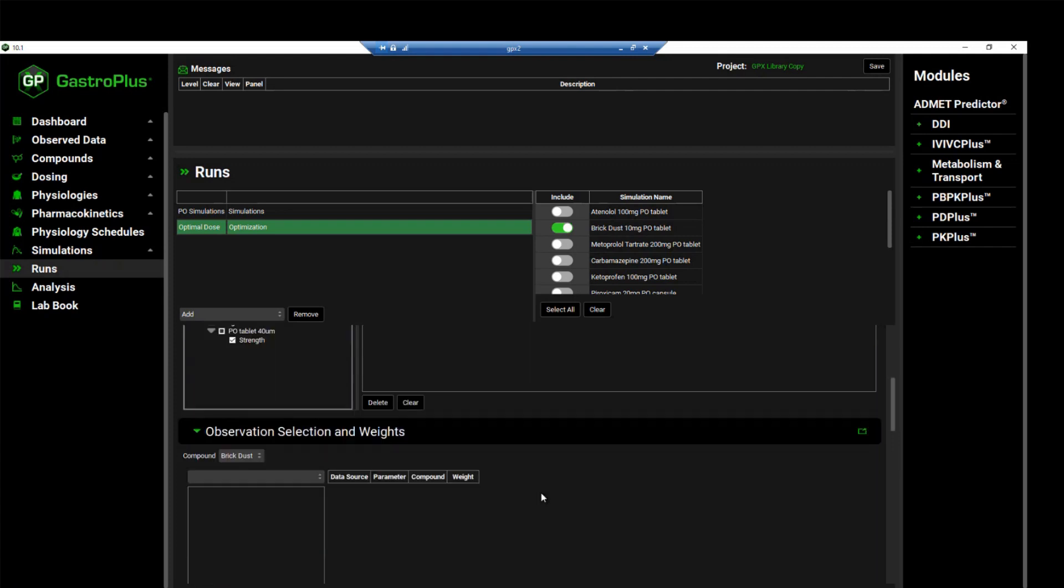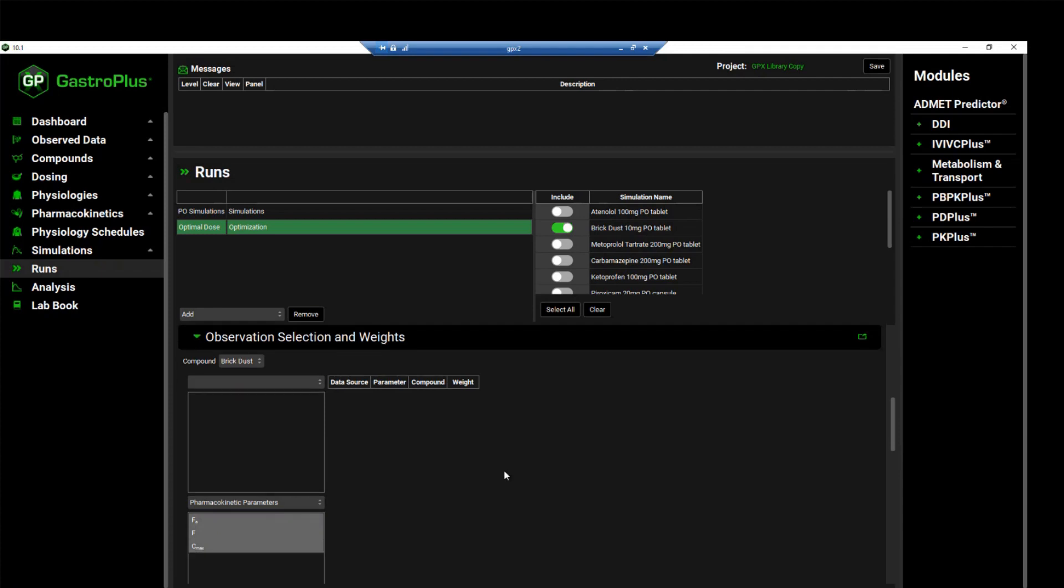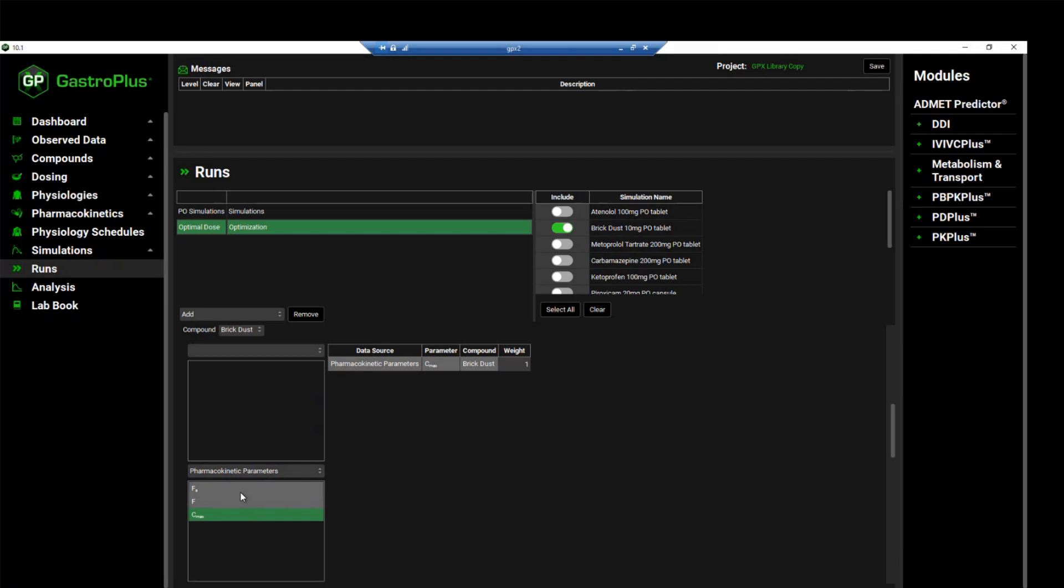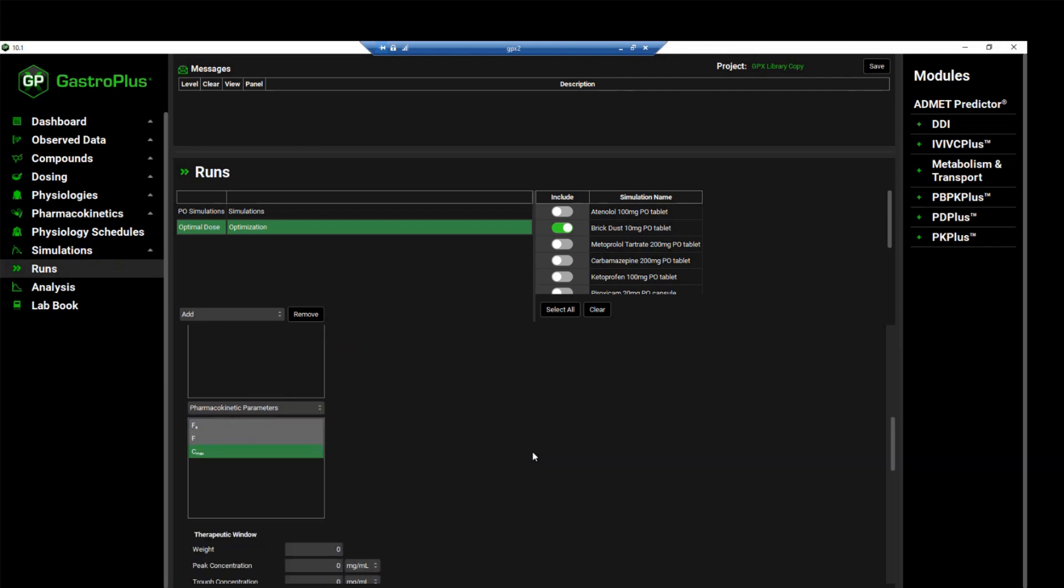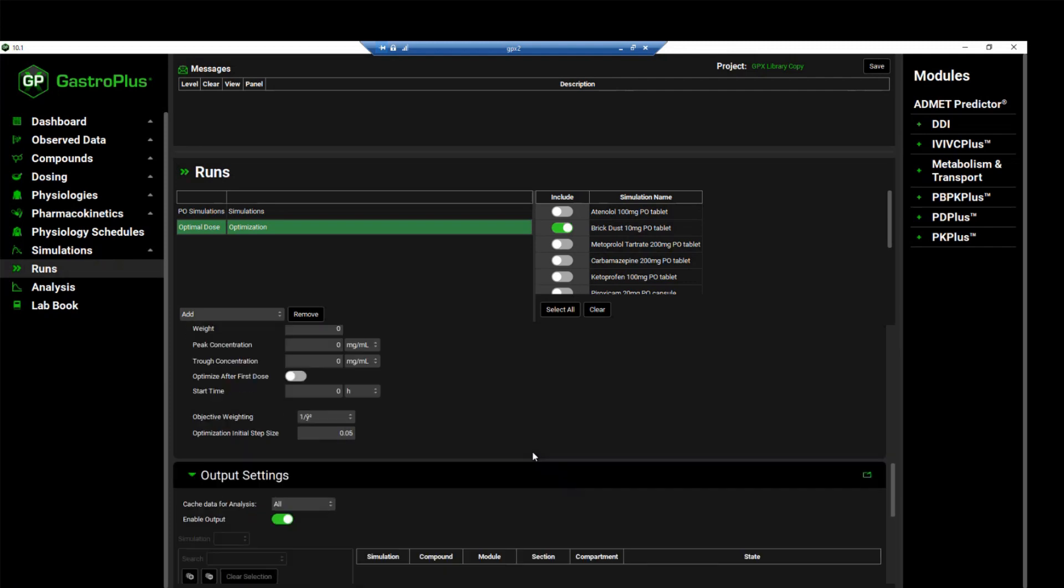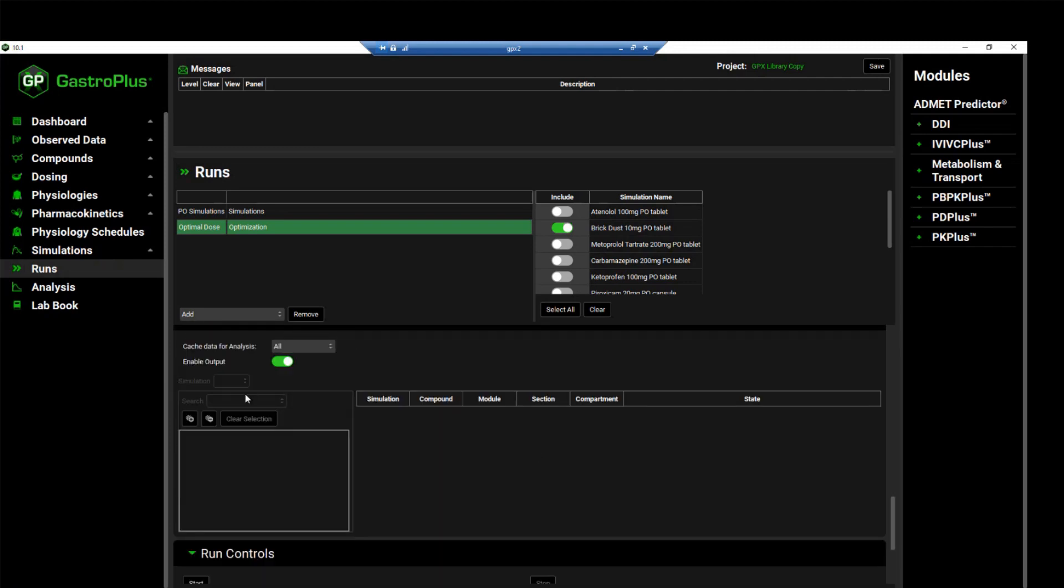Now we will move down to the observation selection and weights. In this case for brick dust, we want to optimize the dose against the CMAX, so you can select the CMAX from the pharmacokinetic parameters frame. And you can also assign a defined weight that you wish to use. In this case, we are going to use a weight of one. We will scroll down to the run controls panel and click start to begin the optimization.